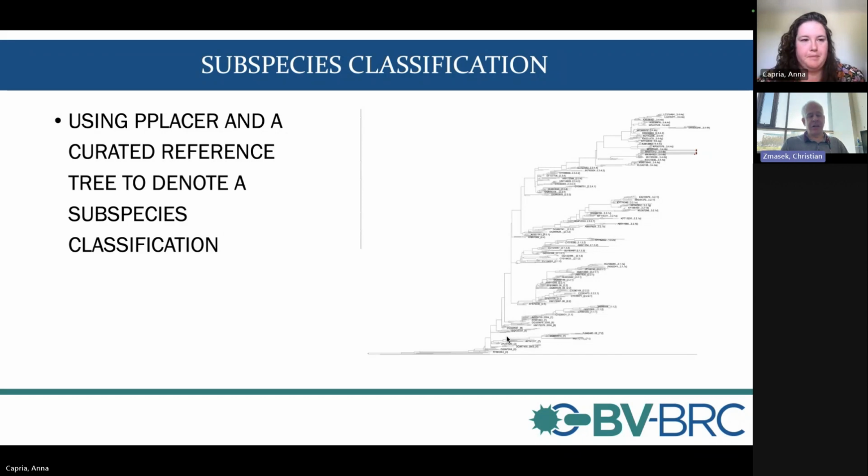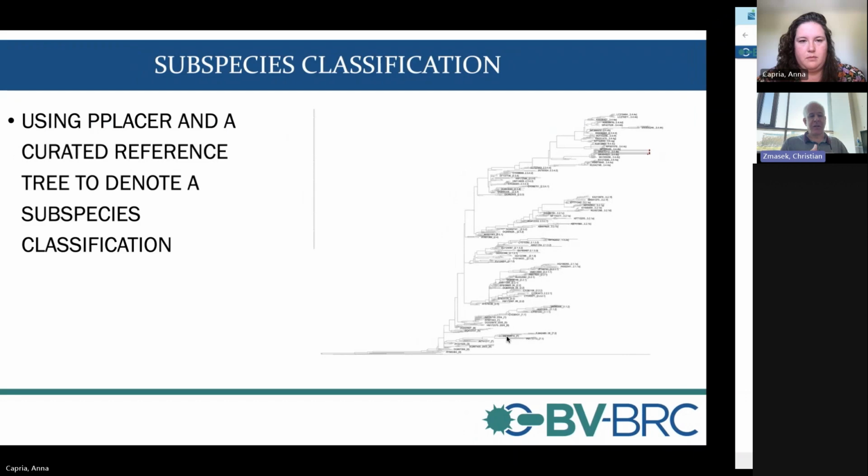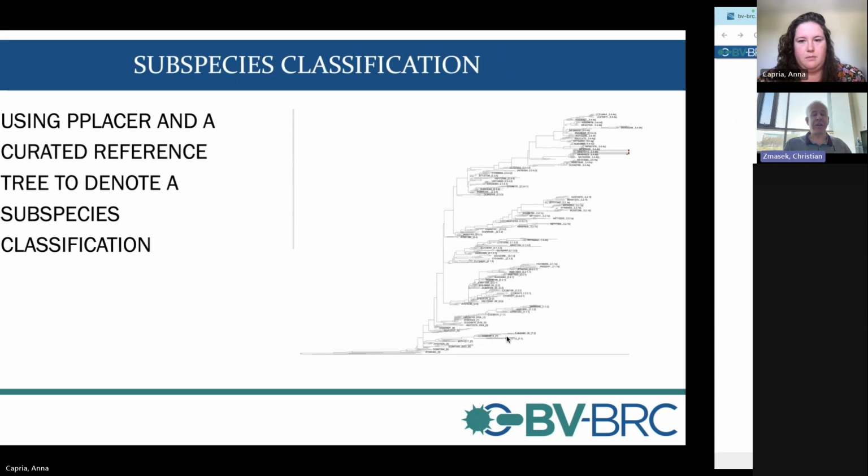And then it uses a tool which we developed called Cladinator, which kind of makes an interpretation of the placement, and then it reports the result back to the user. So you don't actually have to look at the tree, so the program looks at the tree for you. But if you want, you can still see the tree.